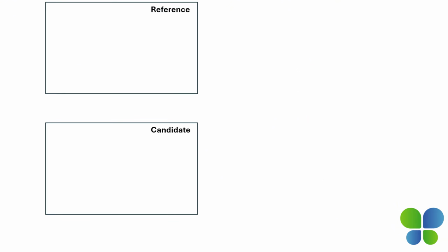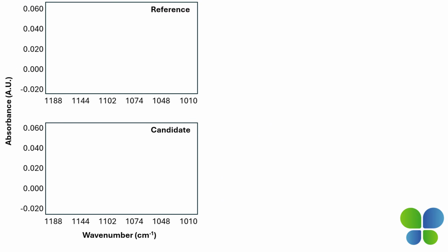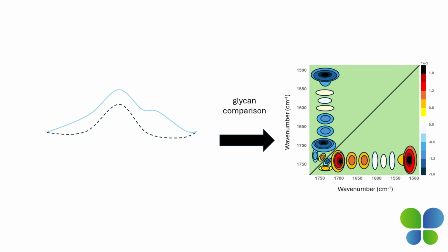When evaluating the spectra within the glycan spectral region of 1,188 to 1,010 wave numbers, the carbohydrate-associated vibrational modes allow for the assessment of comparative differences between two protein samples to establish differences or similarities in the extent of glycosylation. The assignment of the cross peaks can be validated by the correlations established. Similarly, cross peaks associated with the excipients can also be used to confirm formulation conditions.